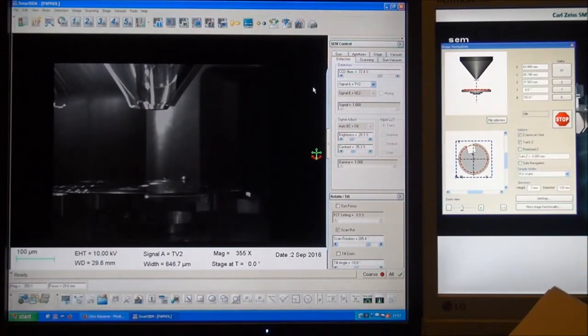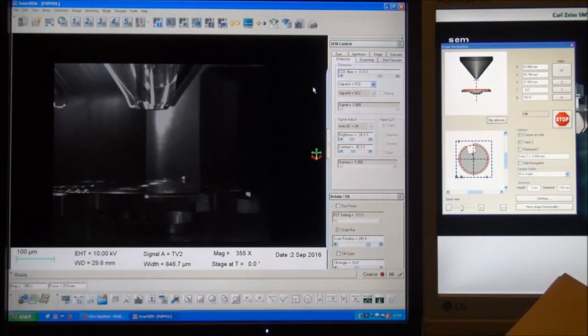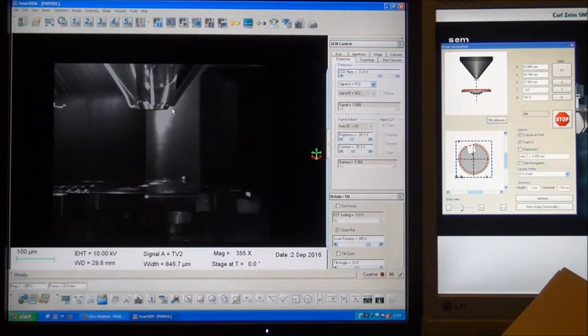This camera shows the planar view, and you can see the distance between the sample and the pole piece very clearly now.